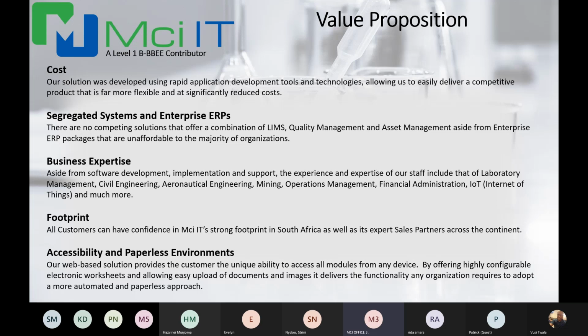to manage quality and to properly manage inventory, etc. So on the LIMS front, very few competitors, and we've even been working with some of the largest tech companies in South Africa, such as EOH, who approached us because they realized that what they thought was a LIMS module in their enterprise ERP system was all but that. It fell significantly short because they view the LIMS module as a side module, and they don't build in the necessary business logic that's really required for it to be a management system for laboratories.